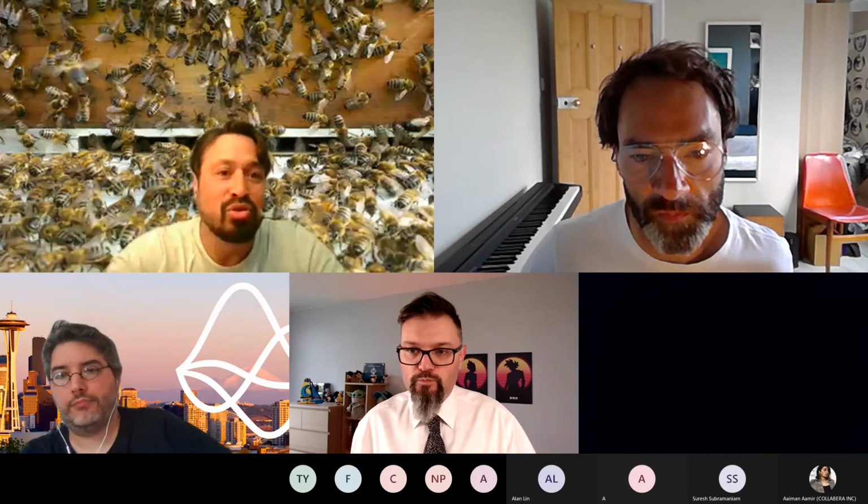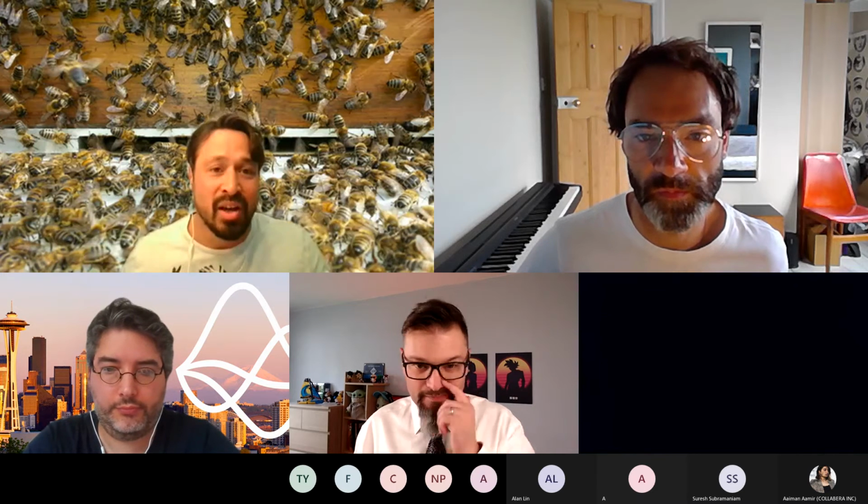And if I can add, we also had some chemical preparation, because like this the pollen is more transparent, and as it is more transparent, we can really look in 3D at all the parts of the pollen under the microscope. We move to see all the parts of the pollen, because when we identify the pollen, we need to identify all the holes, because there are a lot of holes all around, and we are supposed to count them. That's why when you are only in 2 dimensions, you cannot see the holes underneath. It's just an example, but you cannot count all the holes on the pollen. That's why I think 3 dimensions will probably be the best way to identify the pollen.